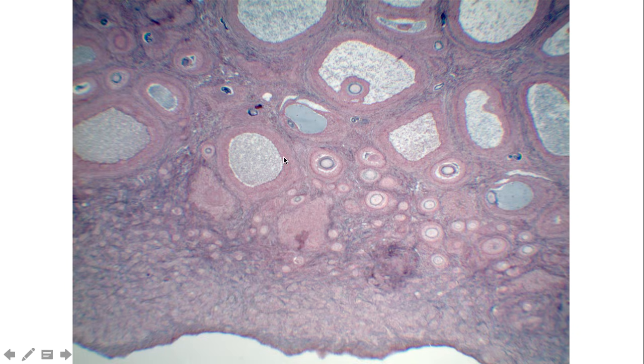The first one here is the ovary, and what you're being asked to identify are the various stages of ovarian follicle development. Within this cross-section, out here is the outer surface of the ovary, and it's out here that you're going to find the germinal epithelial layer. This is a simple cuboidal layer, so we would need higher magnification to really see it.